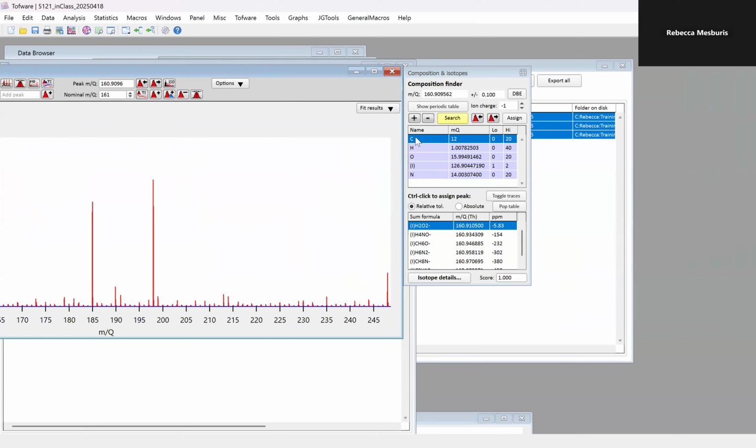But perhaps the most important thing is that you need to make sure you have whatever makes sense for your ion chemistry included in here. Right now we're doing iodide mass spectrometry, so we need to have an iodine here, and we need to always have at least one. So I've put my one down there, and I'm really just searching for one. You set your low possible number and your high possible number. That's what this low and high represent: how many do you want to be searching for? I want every formula to show up below here with an I.